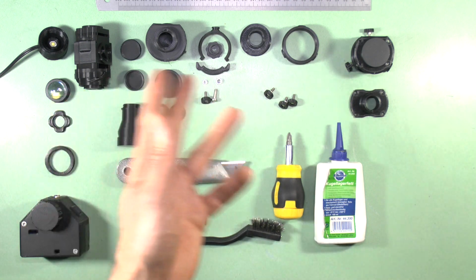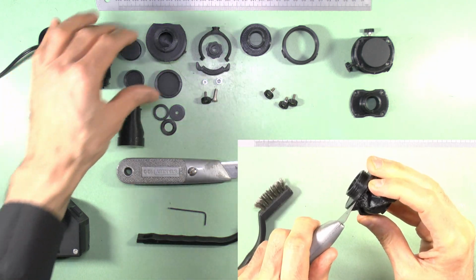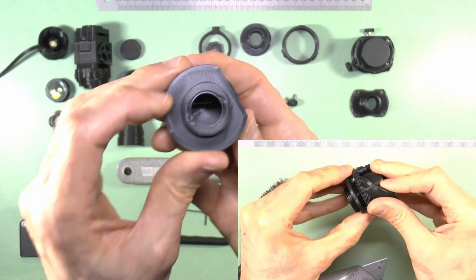These are the parts and the tools you'll need to build the PUMA Epi-Illuminator system. Details are given in the video description. As ever, the first steps after printing involve removing any support structures or stray plastic defects.